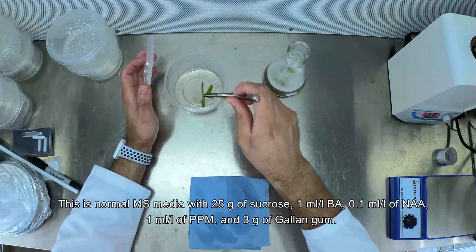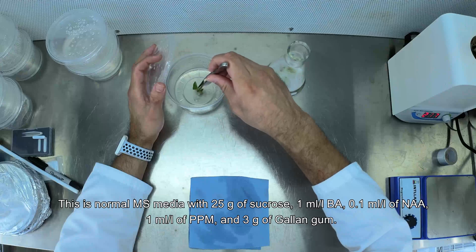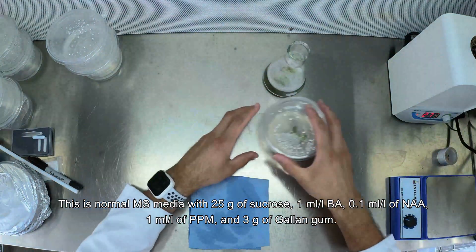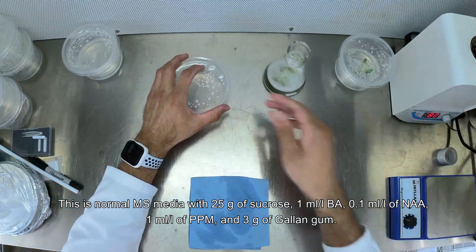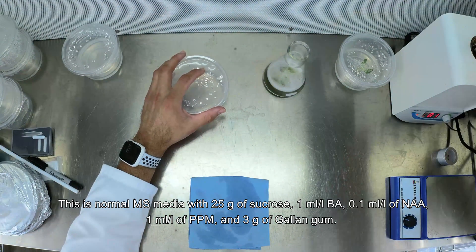1 ml per liter of BA, 0.1 ml per liter of NAA, 1 ml per liter of PPM, and 3 grams of gellan gum.